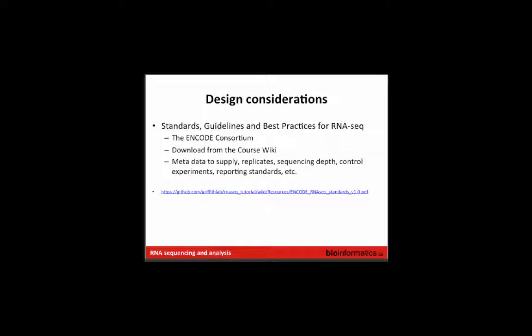Okay, so we've talked around these issues quite a lot now. Design considerations. Of course, when you're at the beginning of your project is a good time to think about how you want to design your RNA-seq experiment, and there are many, many considerations. We're going to talk about a lot of those over the next few days, and we've talked about a few of them already.